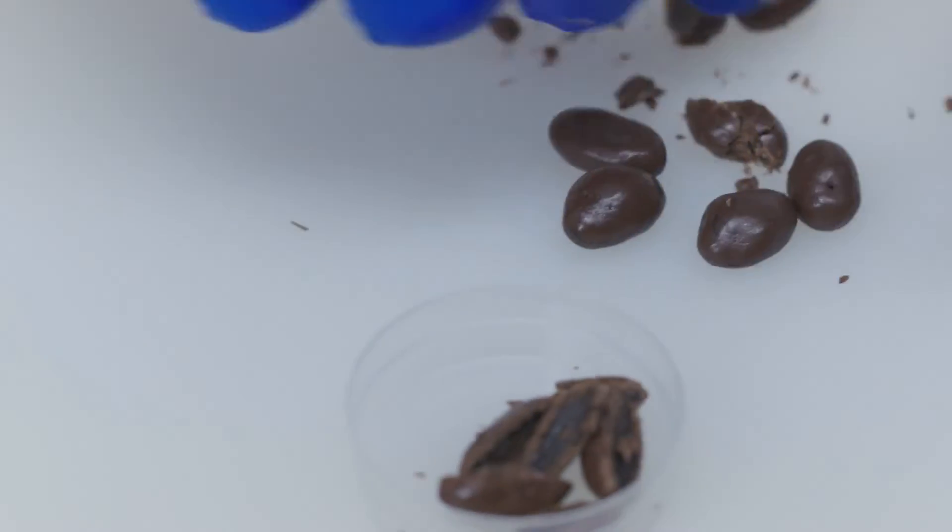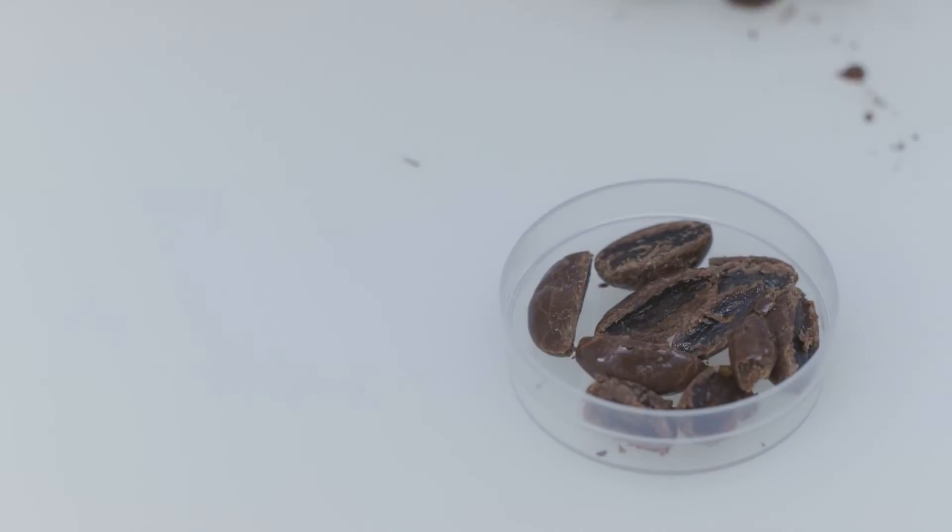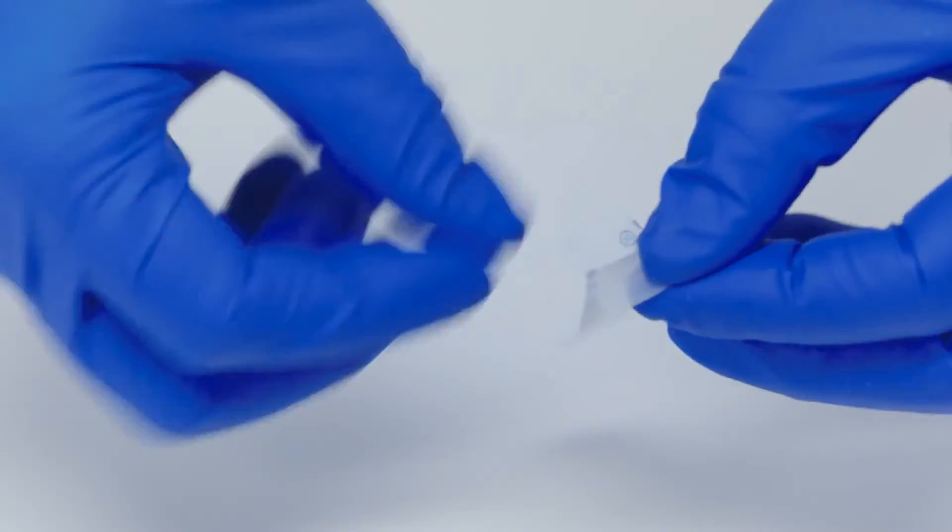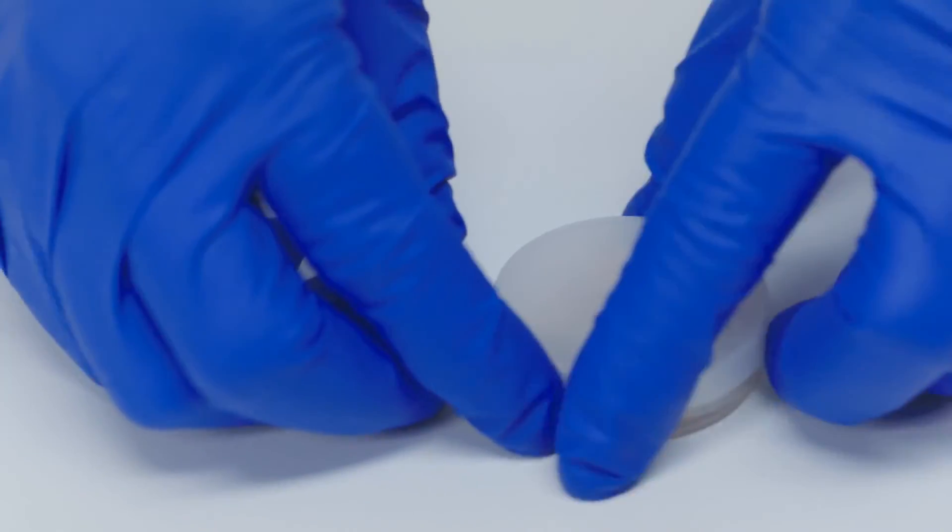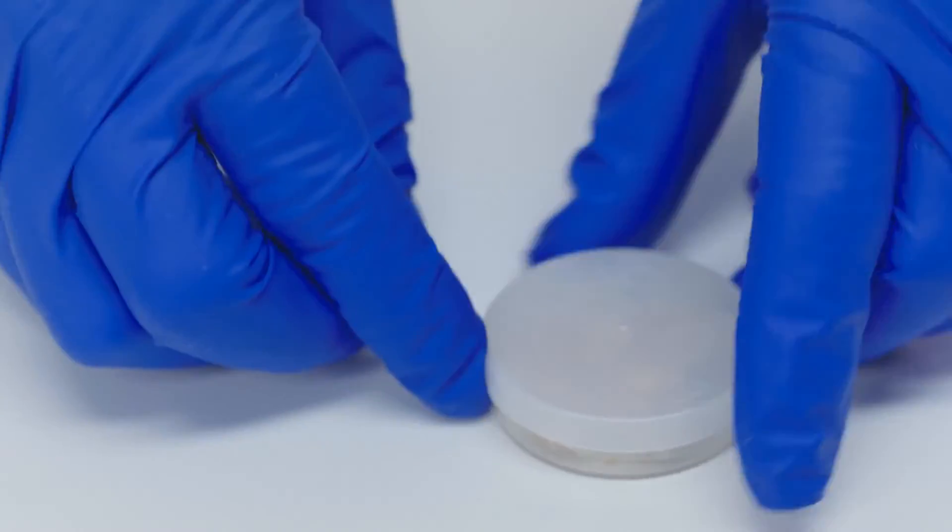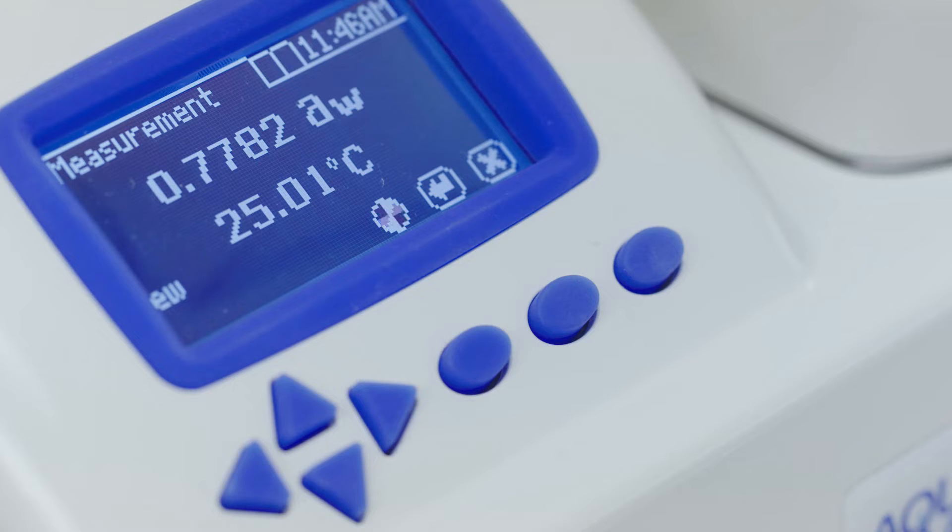Establish a standard operating procedure to specify how samples are prepared and be consistent. Your procedure should include how the sample is handled while waiting to be read, and the temperature the sample and instrument should be at during the reading. When you set up this protocol, consider running your own tests to find which preparation method produces the most stable result.